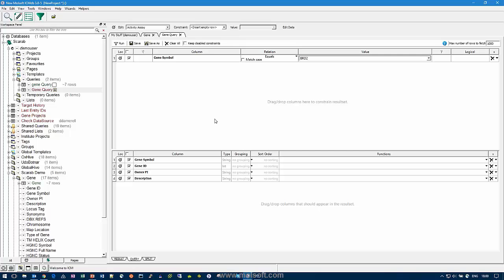Again, I want to really emphasize that we've built Scarab in as agnostic a way as possible in terms of workflow. We've tried very hard to make sure that Scarab is not for a particular workflow to the exclusivity of all. We're trying to keep it open and generic because there are plenty of tools out there that already do many of these cool things these questions are bringing up, like SAR exploring, and we just want to do the data management part and make it possible to capture that information and export it or query it in a way that can then be put into the tool that makes sense for the actual question.